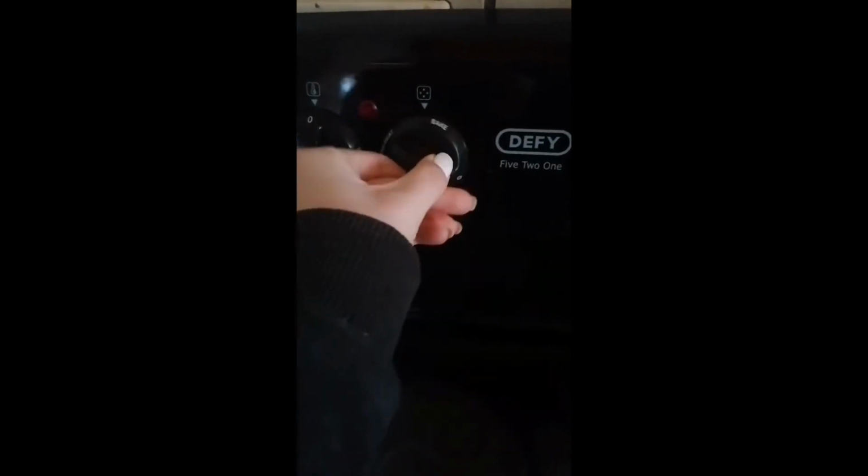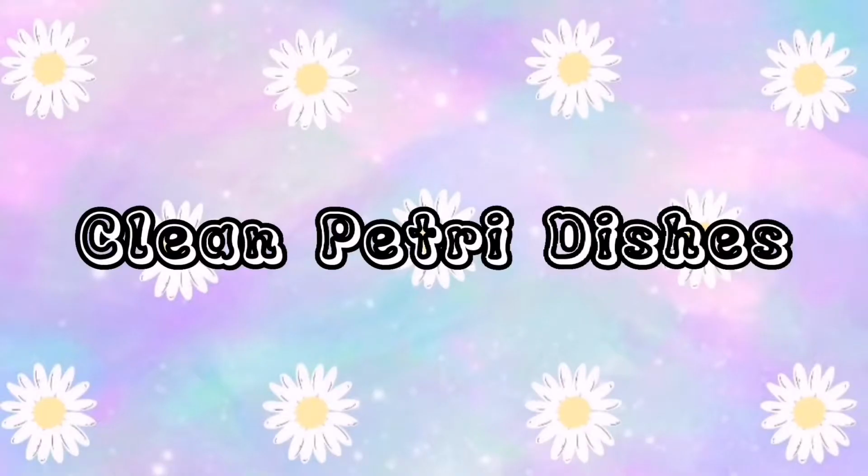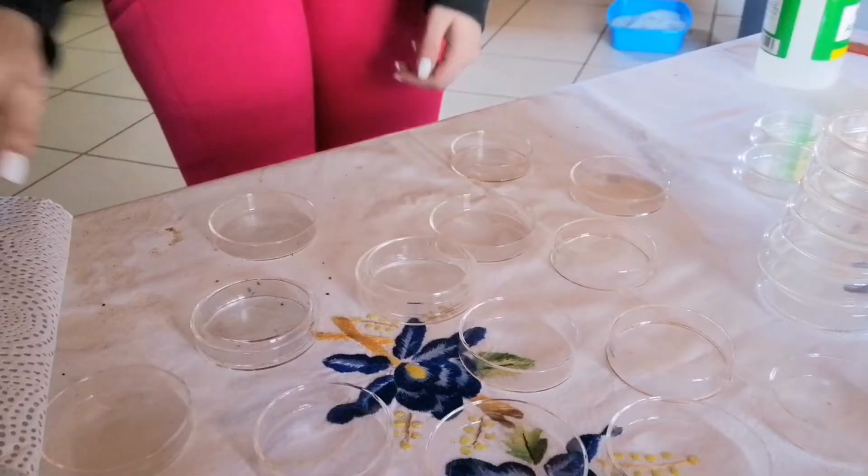Okay, so first let's preheat the oven. As you can see here, I'm just quickly preheating the oven. I'm putting it at 150 degrees, and I think I'm going to do it for 20 minutes. After that, we have to clean the petri dishes.